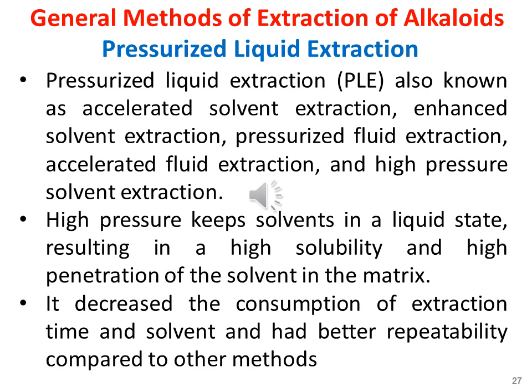High pressure keeps solvents in a liquid state above their boiling point, resulting in a high solubility and high diffusion rate of liquid solutes in the solvent and a high penetration of the solvent in the matrix. Pressurized liquid extraction dramatically decreases the extraction time and solvent consumption and has better repeatability compared to other extraction methods.